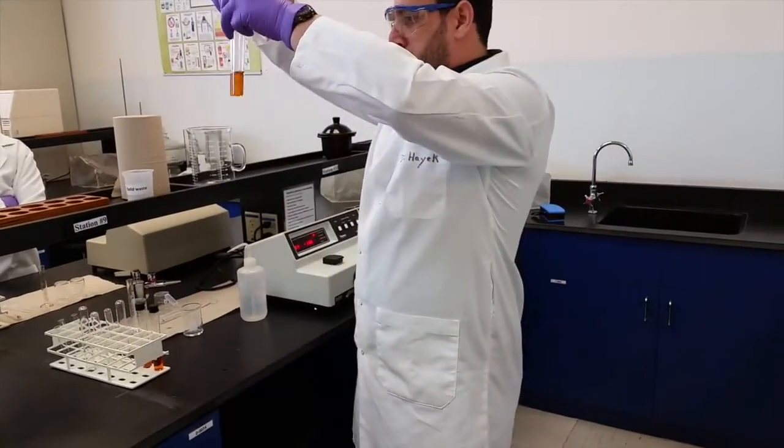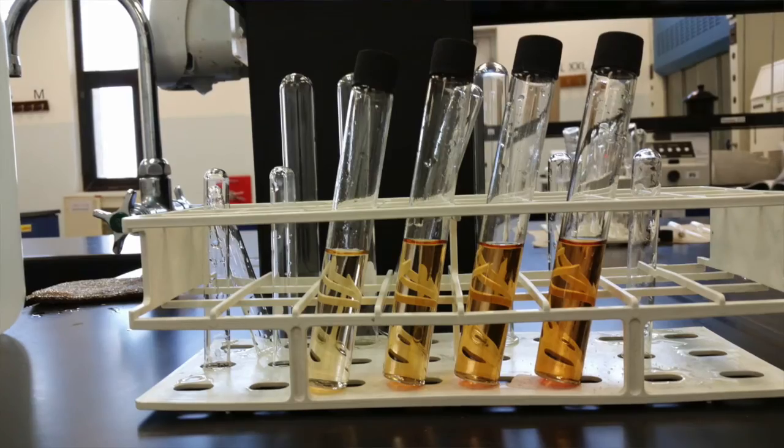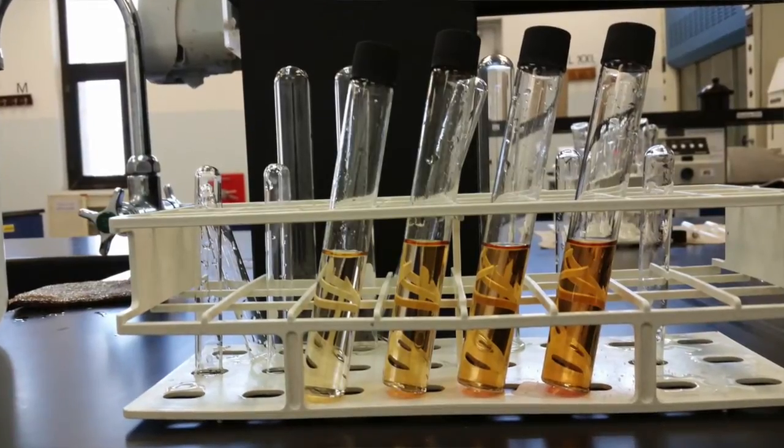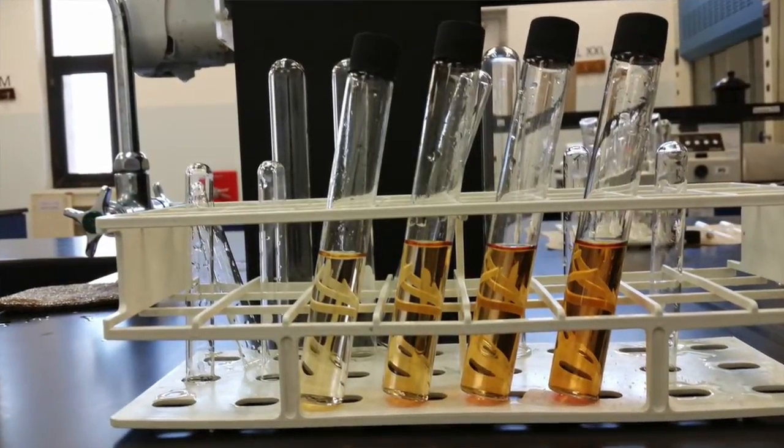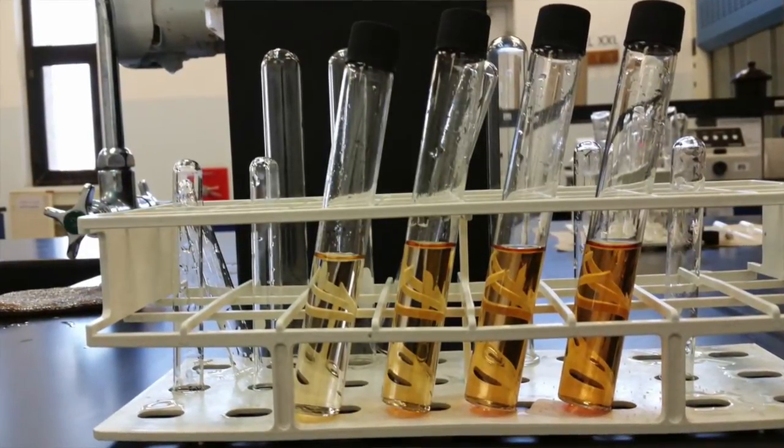We will fix the concentration of Fe3+ and we will be changing the concentration of SCN minus. You can see that the concentration, every time I increase the concentration, the tube or the color becomes darker.